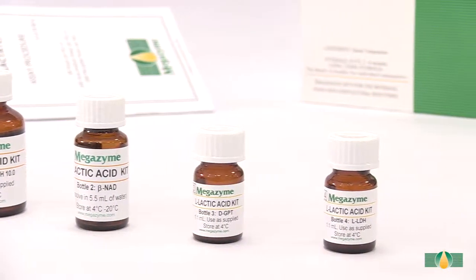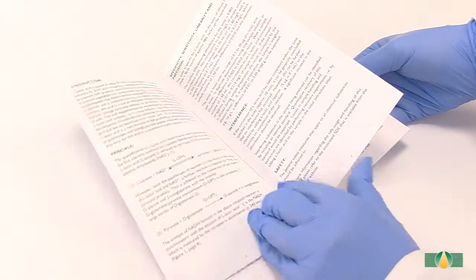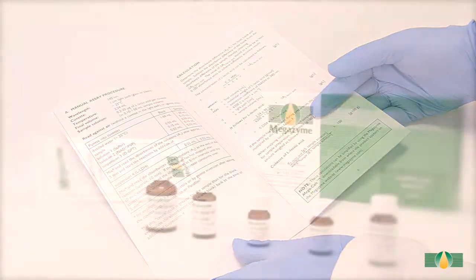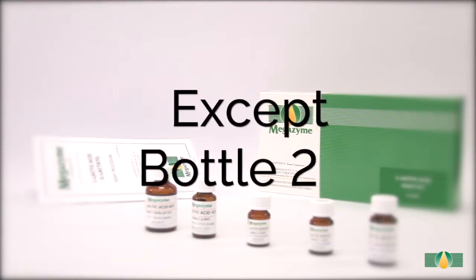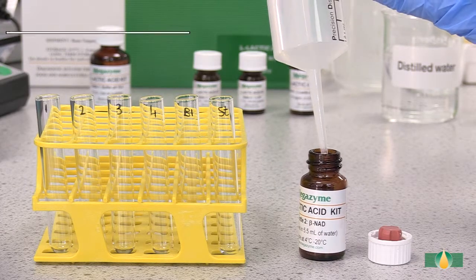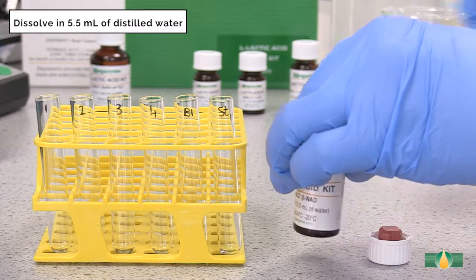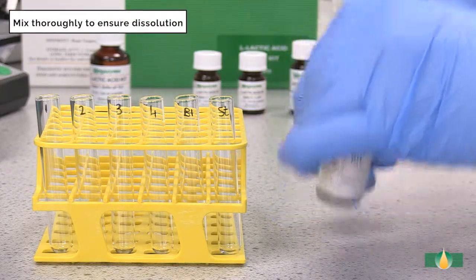Prior to sample analysis, the kit components should be prepared as described in the kit data booklet, and once prepared they are ready for use in the manual assay procedure. All of the kit components except bottle two are used as supplied. The contents of bottle two are dissolved in 5.5 milliliters of distilled water. The bottle is capped and the contents are mixed thoroughly to ensure complete dissolution.